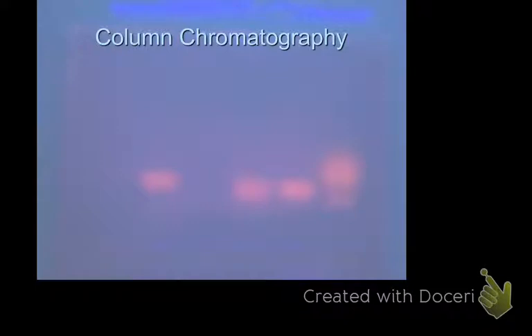Okay. It's a little bit of a misnomer, because the term chromatography comes from color, and not all proteins, in fact many proteins, are not colorful. But whenever they first started doing separation techniques, they were separating out dyes, the pigments from plants and things like that, so that's why they got the word chromatography.